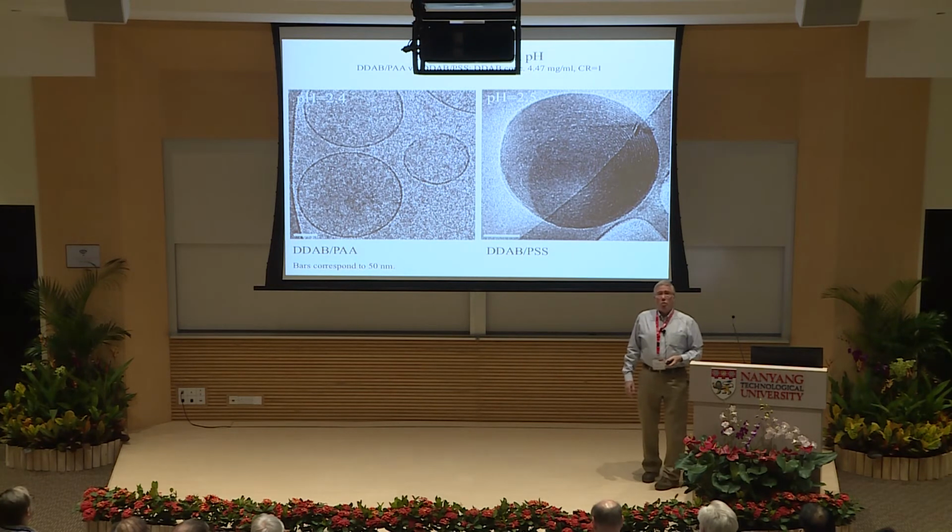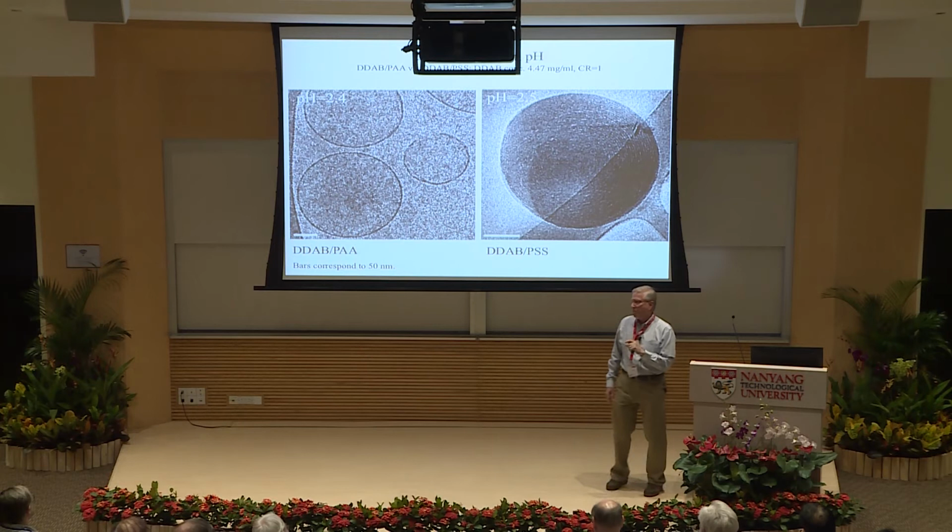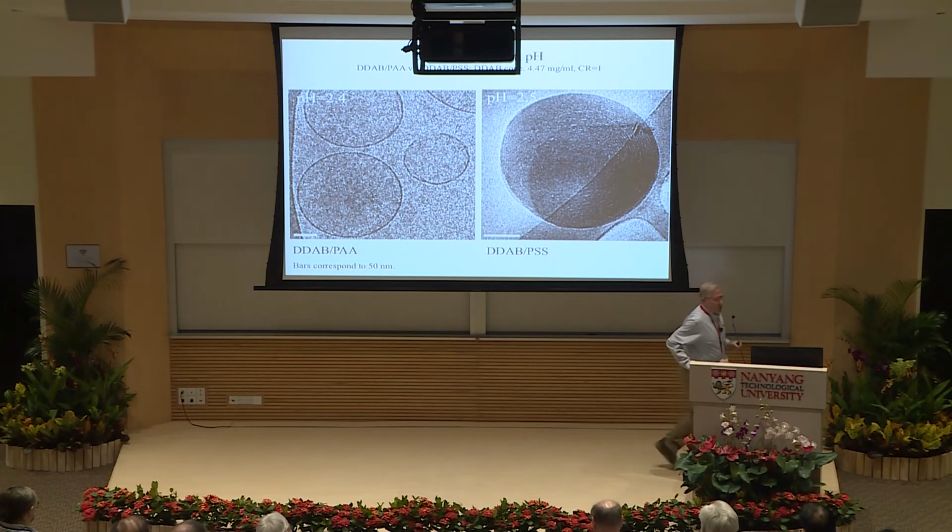One thing that you could have asked is, what about the sizes? Okay, the spacing between those in this lamellar structure. It's very difficult to get those sizes from electron microscopy. I love electron microscopy, but I must admit that it's not the best quantitative tool.